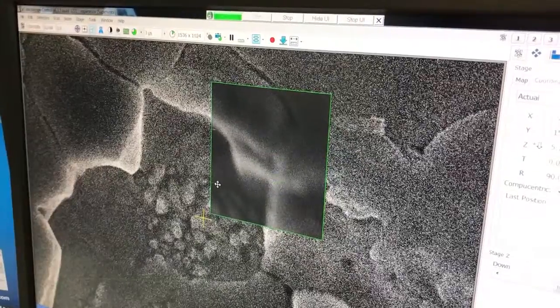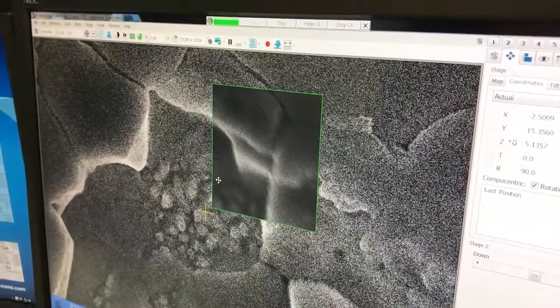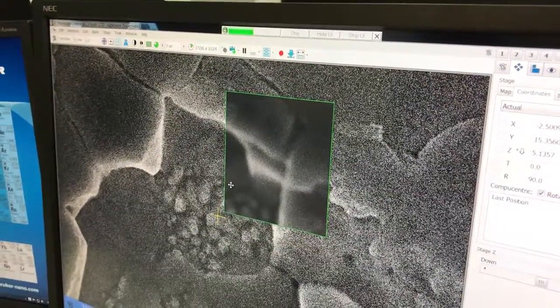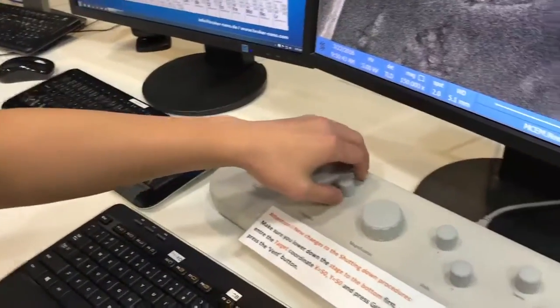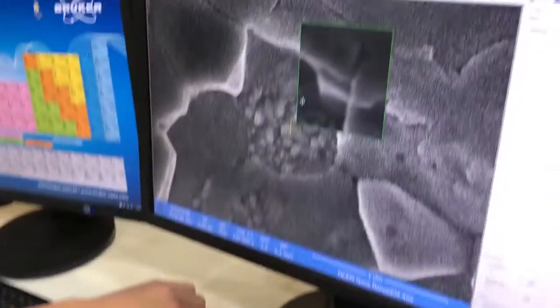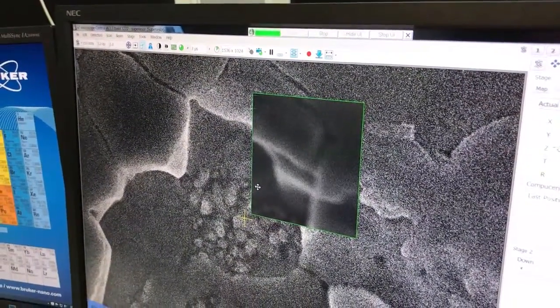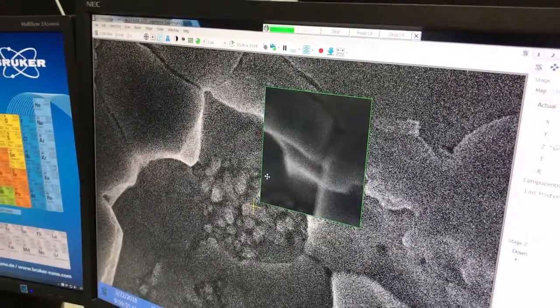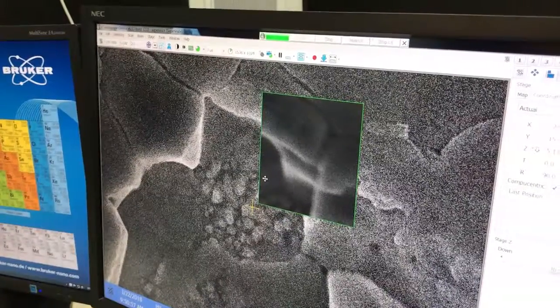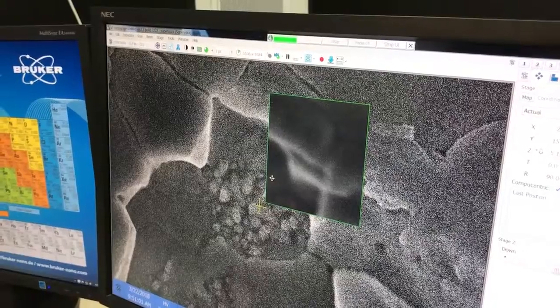Oh yes. So about 45 degrees to the horizontal. Yep. So in order to correct for this, you need to go to the point where there's no smearing of the features, and you're gonna correct the astigmatism by turning these stigmators, X and Y direction. So as you're adjusting, you'll realize the image is getting clearer. So here's a point where it's the sharpest, but to ensure that you're always at the best point, you always want to go to another extreme, and then you can find it.